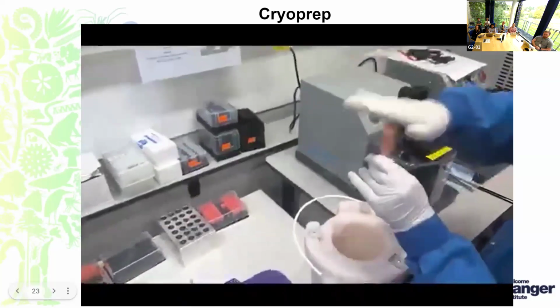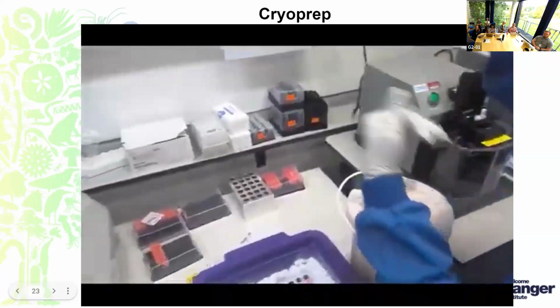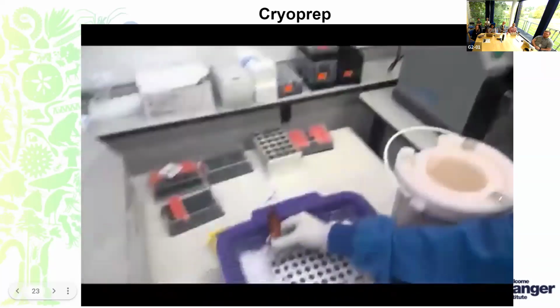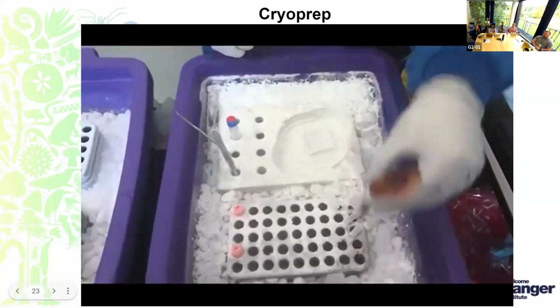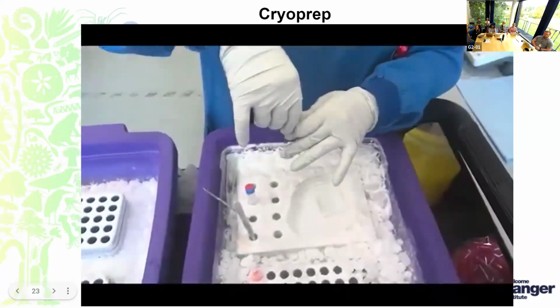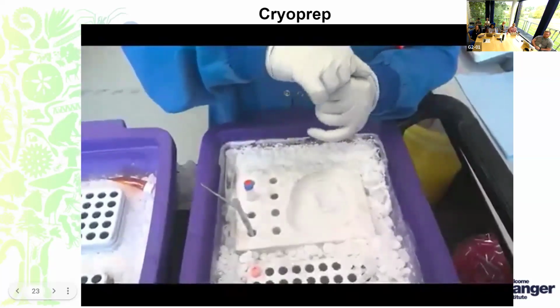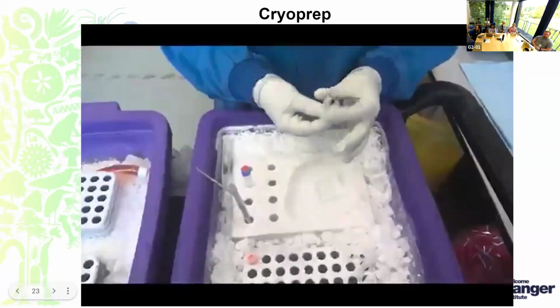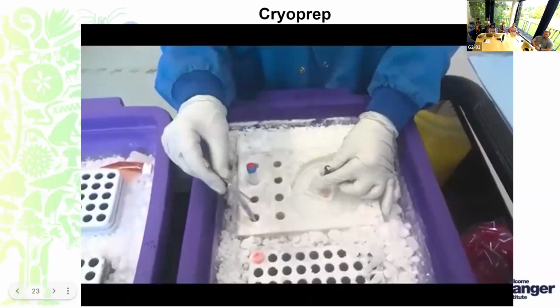Once the disruption is done, we invert the tube and flick the cover so that all the tissue material within the cryo bag comes back to the Fluidex tube, and it's placed on the cold rack. Now we move back to the sample prepping area, where the adapter along with the cryo bags is taken off and the sample is transferred to the weighing board and weighed. Based on the requirement for the downstream processes, it gets transferred into new Fluidex tubes.